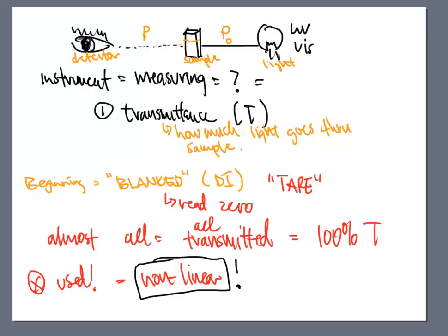So the very early instruments had a percent T or a transmittance value that it was giving. And this percent transmittance value caused us problems, but we dealt with it. The newer instruments, though, are defaulted to another setting. They are not percent transmittance machines. But we can go in and switch these new machines over to percent T, and that will allow me to make measurements like the old timers used to do it.